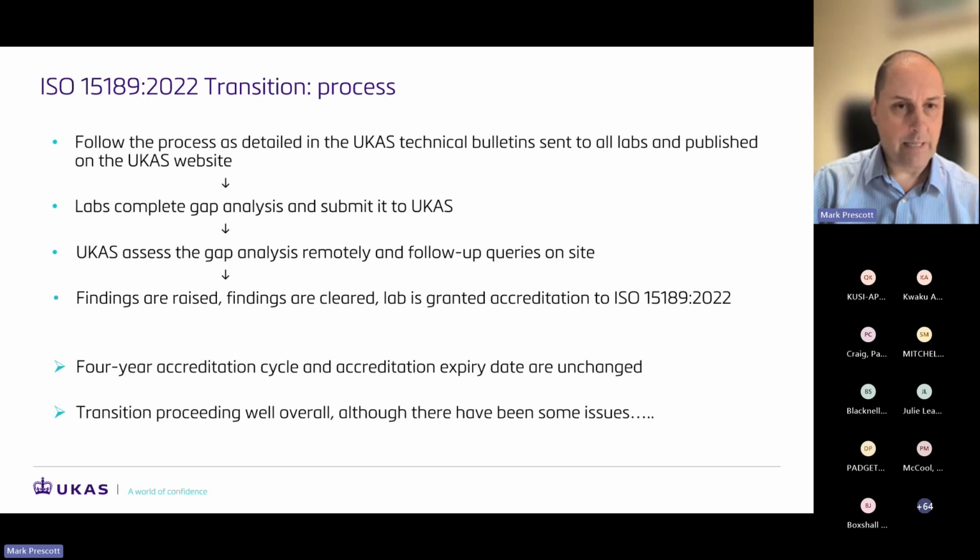Any non-conformities relating to the transition are obviously recorded as they normally would. We are separating transition findings and normal surveillance findings at the minute, so we can maintain labs' accreditation to 2012 in the meantime. But once all your findings are cleared to 2022, then you can proceed towards the grant of accreditation to the 2022 standard.